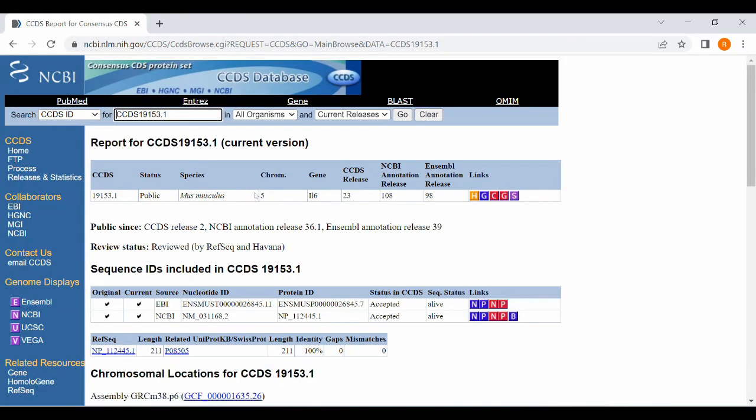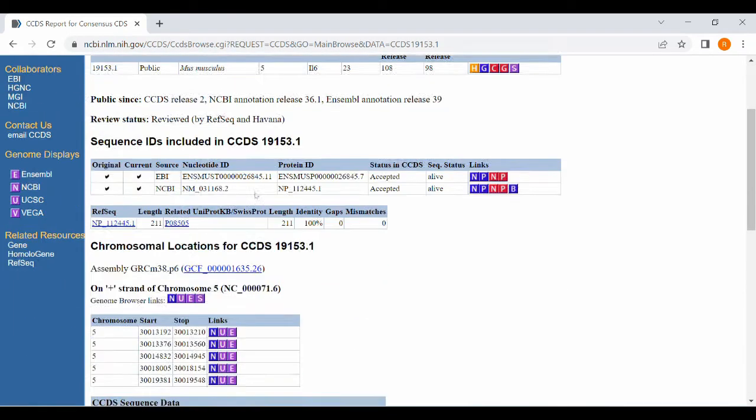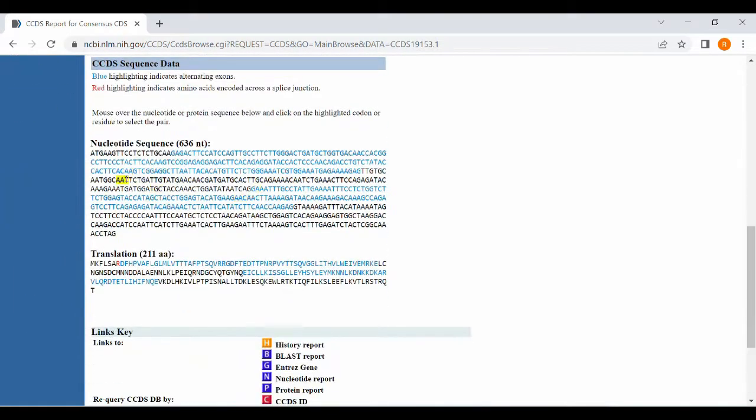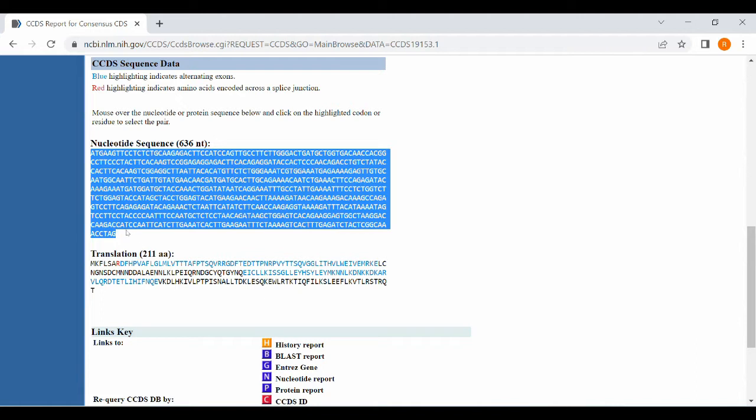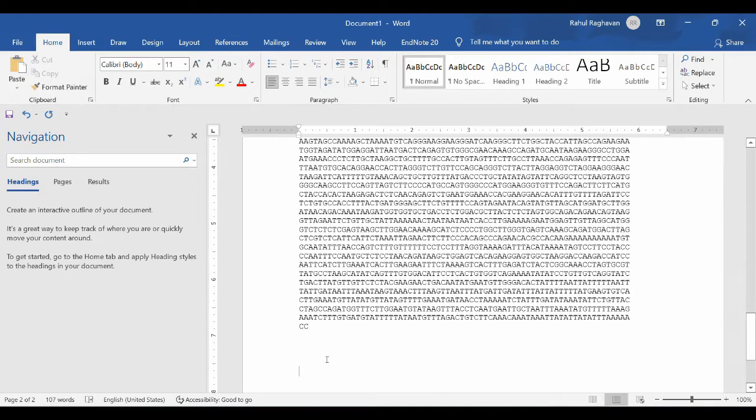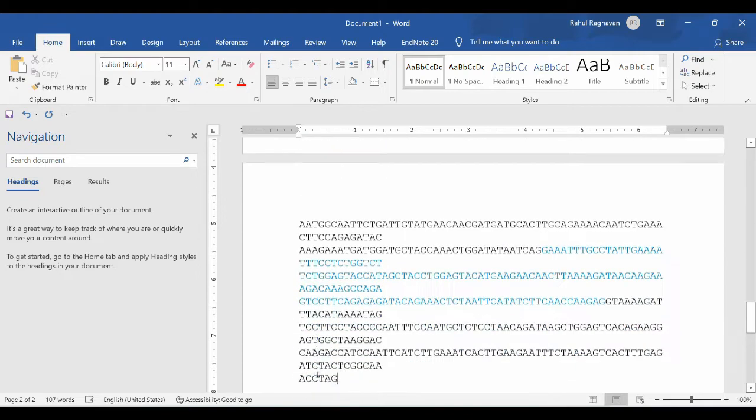You will be taken to the CCDS database and you will have the cDNA sequence. Black color indicates one exon and the blue color indicates another exon. You copy paste the entire nucleotide sequence into the Word format.